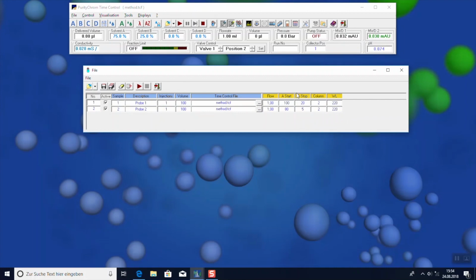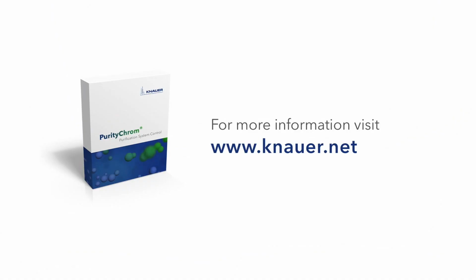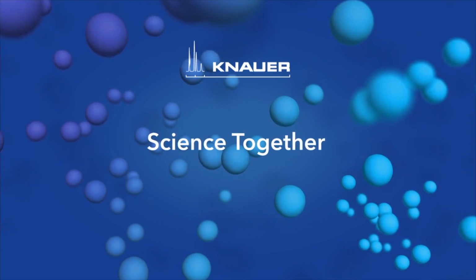I hope I could convince you with this short tutorial that the variables implemented into PurityChrom 5.9 are a great tool for achieving the best performance with your purification system.